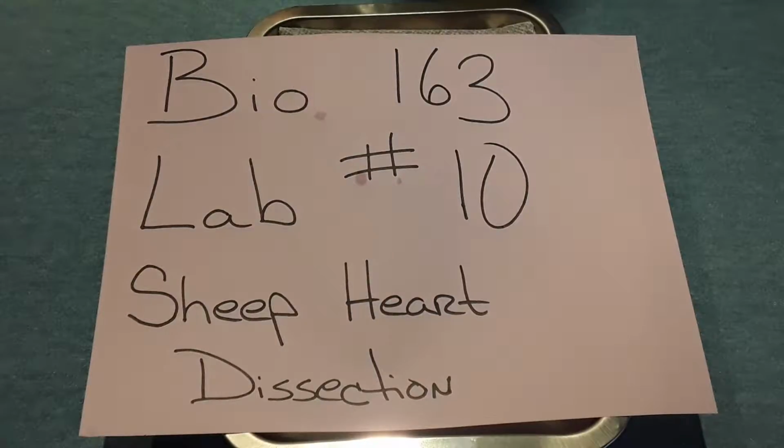Hello, this is Bio 163, lab number 10, sheep heart dissection. The heart has been dissected, and this video is going to go over some of the anatomical landmarks, external anatomy, and internal anatomy. And my name is Christopher Pleasant.